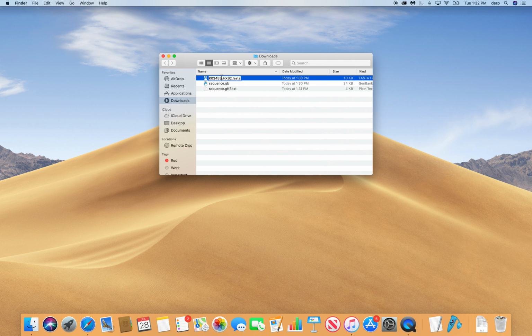And sometimes those periods can be a problem as well. So let's just take this string, the base accession number K03455 underscore HXB2. And then we can rename our GenBank file that. And then we'll have to do a couple of things for this here. Get rid of that beginning part.